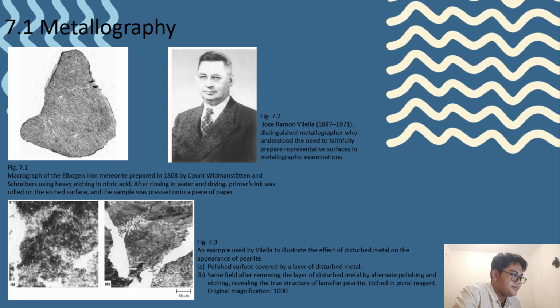The examination of structure may be done over a wide range of length scales or magnification levels, ranging from a visual or low magnification examination to magnification over 1 million times. With electron microscopes, metallography may also include the examination of crystal structure by techniques such as X-ray diffraction.